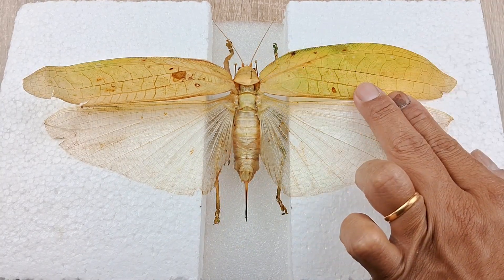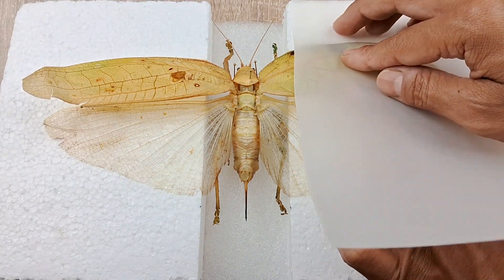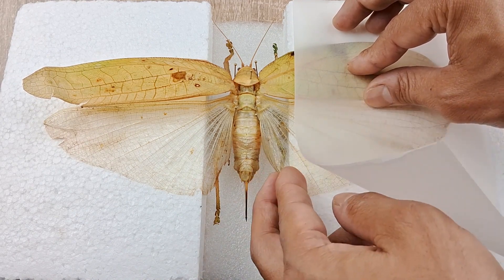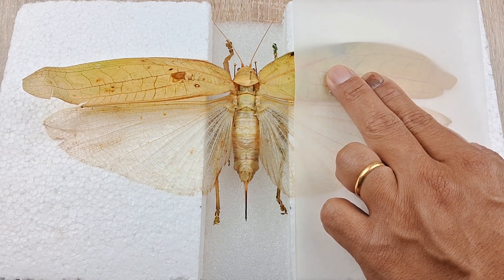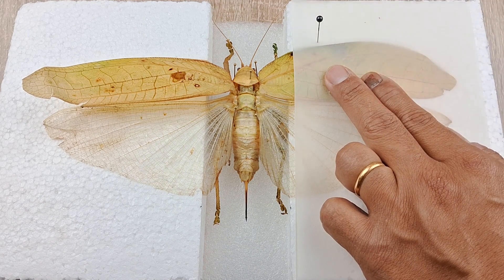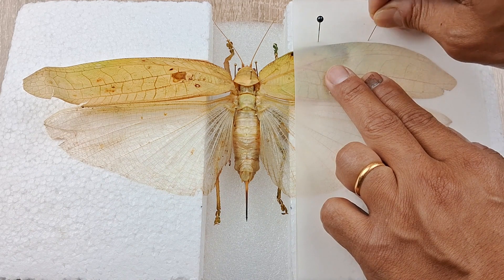Now take one of the tracing paper strips and lay it on top of the fore and hind wings of one side. Remove the pins used to support the wings and while pressing the paper strip down with one hand, arrange the wings in the final position you want them to remain once dried. Use blunt tip forceps to move the wings up and down if required. Once you have set the wings in the desired position, secure them in place using numerous fixing pins. Do the same with the other pair of wings.